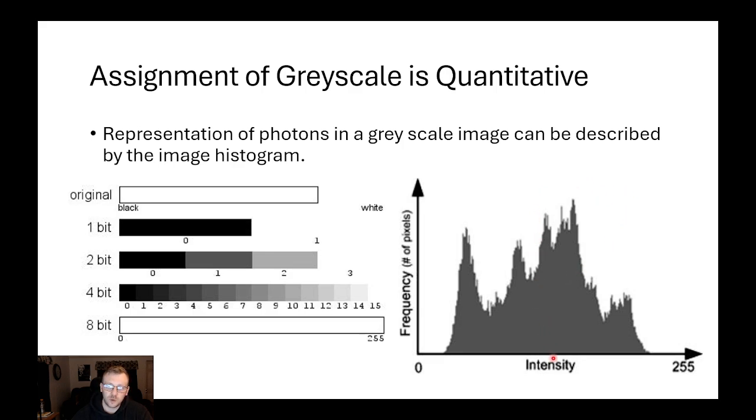And then we get this really big spike here. This is likely going to be the true data, right? This is going to be the true value of what you have, where you're getting a lot of pixels that have a similar intensity, a similar brightness. The words intensity and brightness can be used interchangeably in this case, where we have a lot of really bright pixels in this range. And then we get some hot pixels over here, which maybe means we had a really strong localization of a lot of proteins.